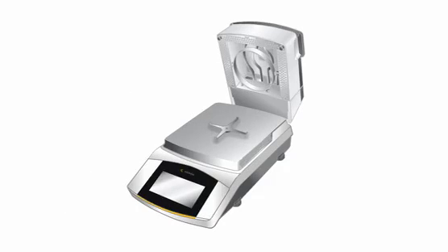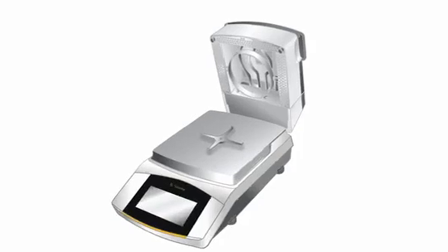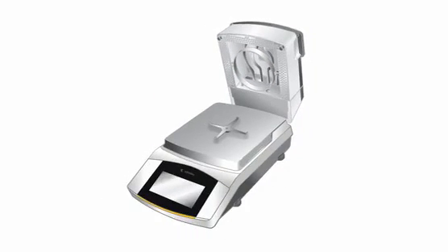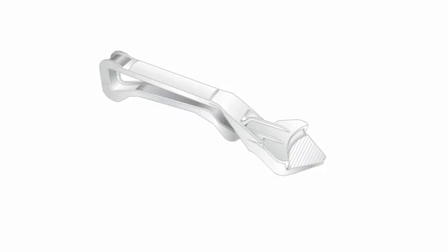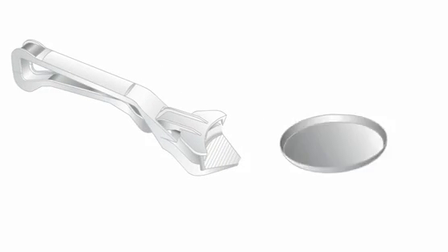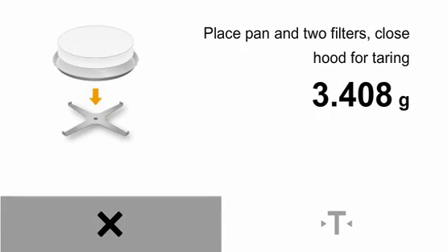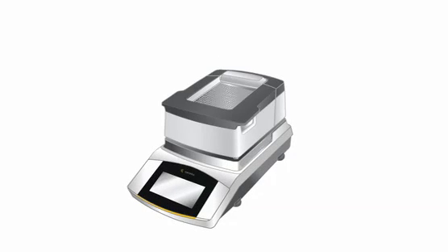Tearing of the moisture analyzer MA-37. Open the hood without any obstacles. First of all, please place a filter on the sample holder, and then lay the sample pan on the filter. Please use a new sample pan for each moisture analysis. Now, place a second filter into the pan. Close the hood afterwards. The moisture analyzer MA-37 starts tearing automatically.